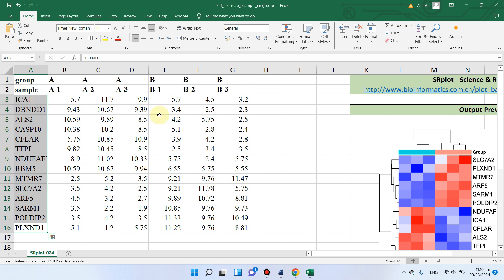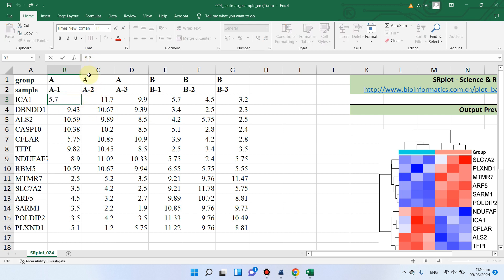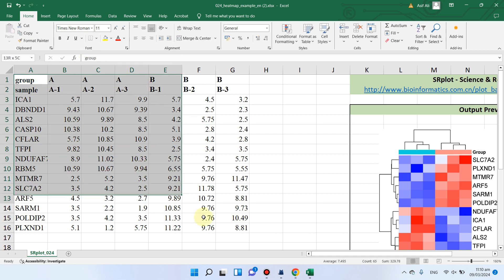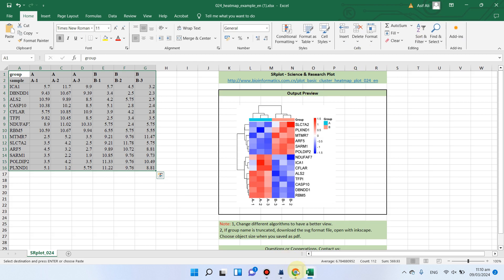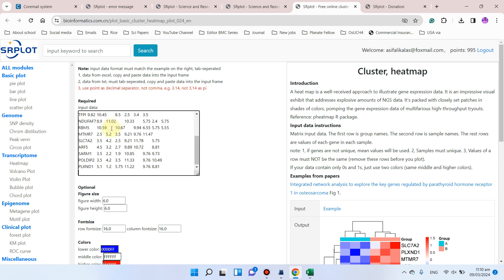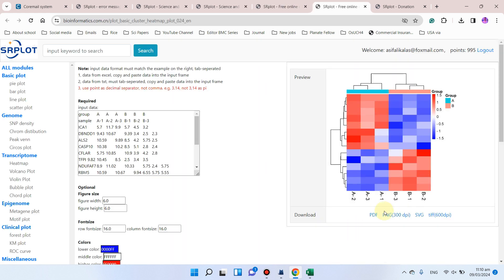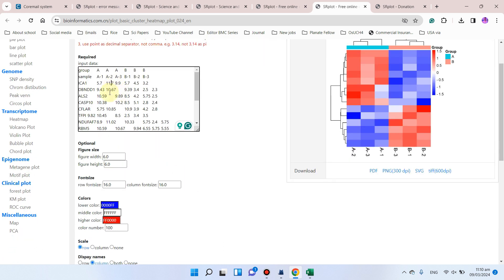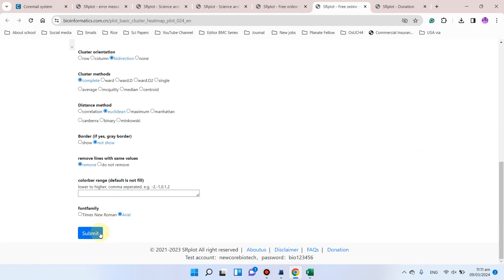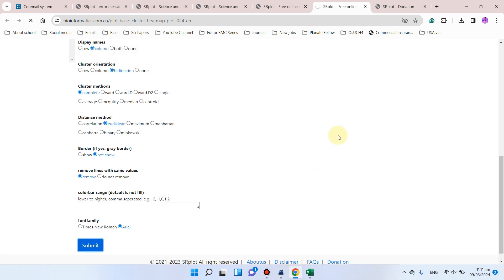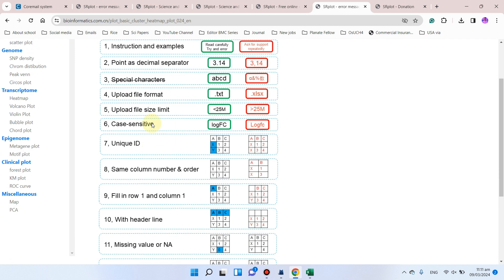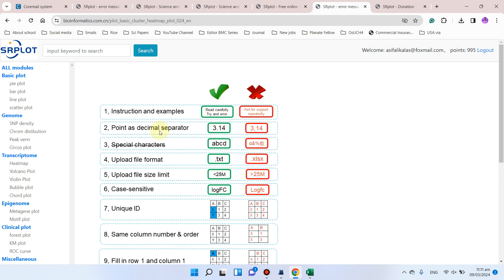One more important thing: if there is a value like 5.7, you must use a dot as the decimal separator. If you replace the dot with a comma, it will give an error. Let me demonstrate — when we copy the data in the exact format and paste it into the website, a heatmap is generated correctly. But if we replace the dot with a comma, you can see an error appears on the screen.